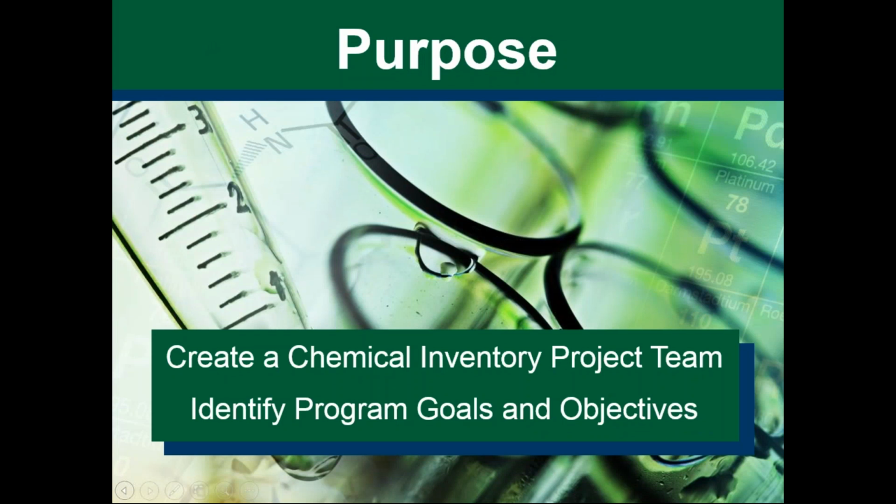So the purpose is really why you're embarking on this endeavor. Why are you trying to create a chemical inventory? What are your goals, and what are you trying to achieve? What objectives are you looking to achieve?